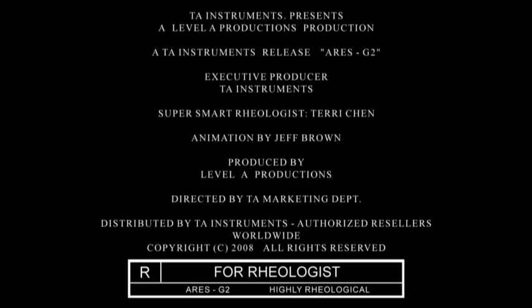Now available for purchase. Only from TA Instruments. Additional features coming soon.